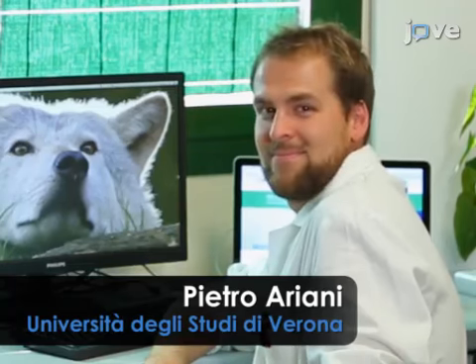The main advantage of the whole procedure is to provide an exhaustive list of experimental steps to achieve a complete gene family characterization. This procedure can be applied for any gene family of any plant species for which genomic data are available. Moreover, this global approach provides valuable information to identify interesting candidates for functional studies. Demonstrating the whole procedure will be Pietro Ariani from my laboratory.